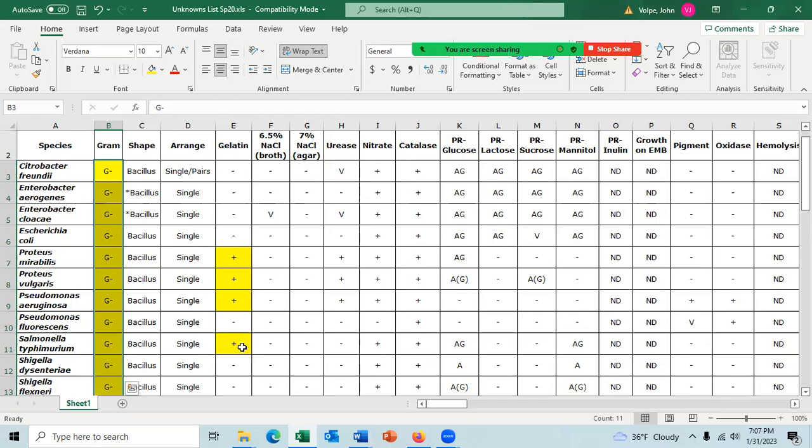That's doing dichotomous logic. You'll do the PR lactose test, but actually all of them will be negative in this case, so it doesn't help you narrow it. And then you can do another test to narrow these four. You would not want to do 6.5% sodium chloride because all of these are negative. It won't help you narrow it. You wouldn't want to do 7% sodium chloride either.